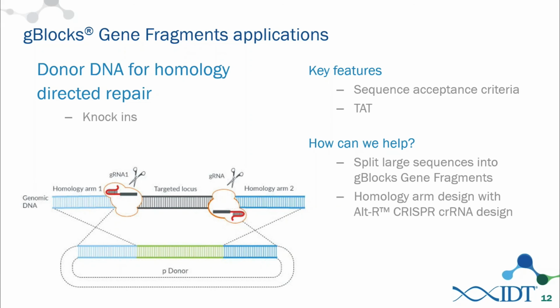Okay. Here's a big picture kind of question. Do you imagine that the cost of synthetic DNA will continue to drop, or are we reaching a lower bound? Yeah, that is an interesting question. I don't think that we have reached the lower bound yet, and I think there's some of our competitors out there that have some exciting technologies that are bringing large-scale gene synthesis into the realm of synthetic biology. I think there's still some limitations with that type of technology, but I think that's a really interesting idea and an idea we're exploring as well.